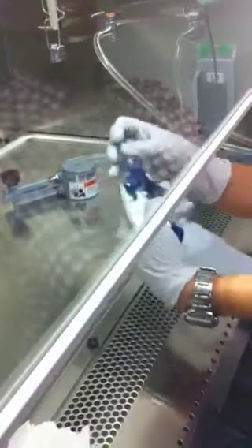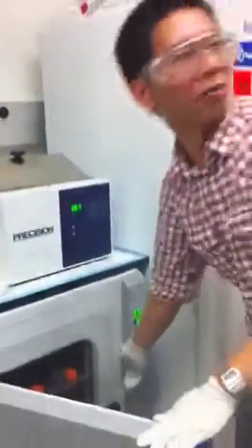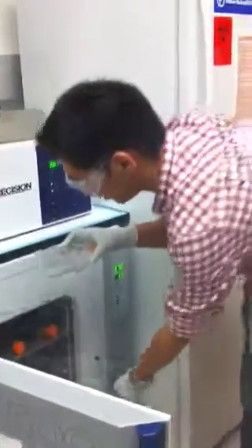So just put your ethanol right next to it and spray a little bit into it. That's all. Okay. So now we are ready for splitting. Usually I would already know how much I want to split, and then I take out my plate.